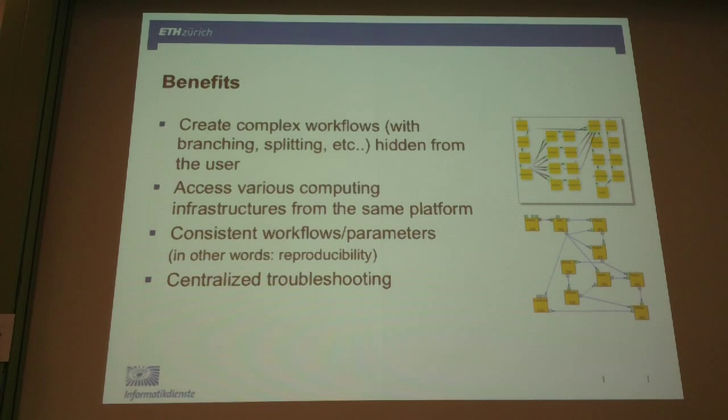So of course it needs some tolerance from the users that they are not allowed to hack as they want, but you get some consistency, you get some reproducibility. And you also have this centralized troubleshooting, so all the errors appear in the end in the gateway, no matter on which computing infrastructure they originally happened. So it's easier for admins and users to troubleshoot because it's centralized.